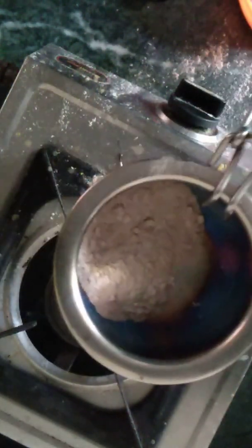We will pour this mixture into another container. What's the state of this container? It has become blue. That's because it got red hot, but after cooling it has given a nice blue shade. And we have poured the mixture. For testing, we will take some water and pour this substance in that water. So let's do that.